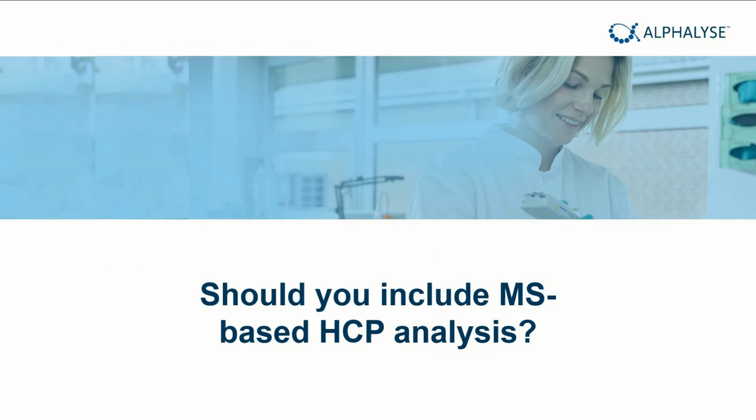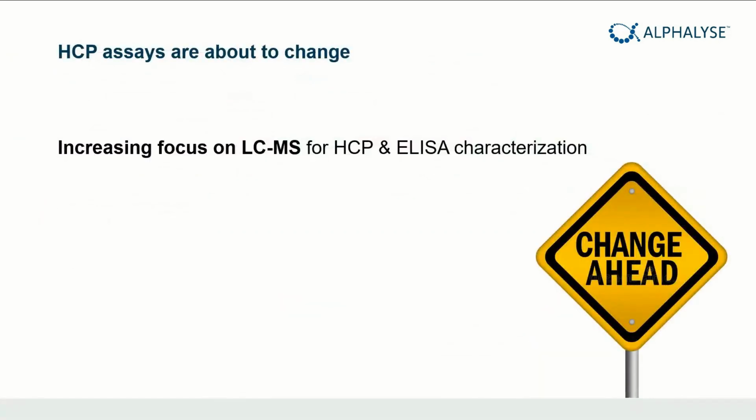Why should you include MS-based HCP analysis, or should you? What we can see from all authorities, publications, and the US Pharmacopoeia chapter about to be released, is that HCP assays and their use for development of biologics is about to change. It has already changed. There is an increasing focus on the use of LCMS for HCP analysis and for characterization of the ELISA that you use.